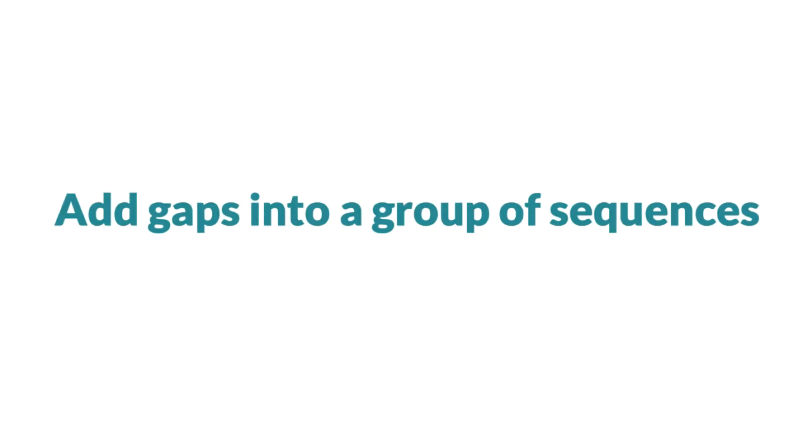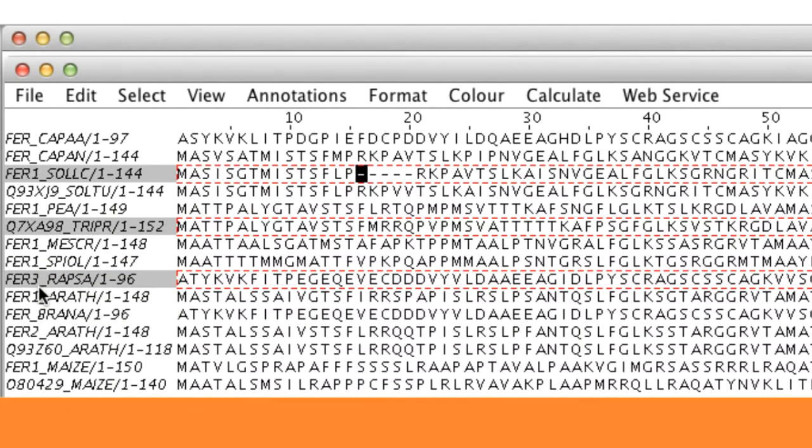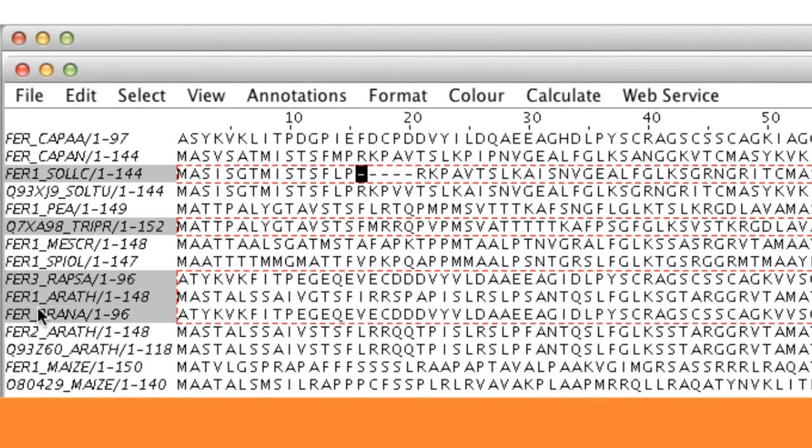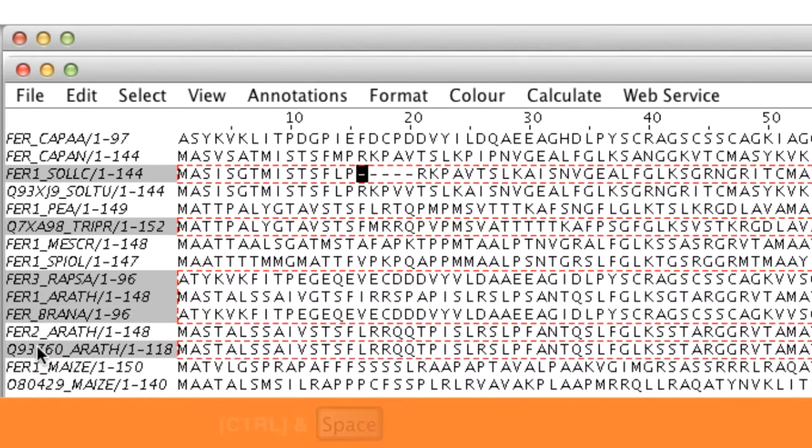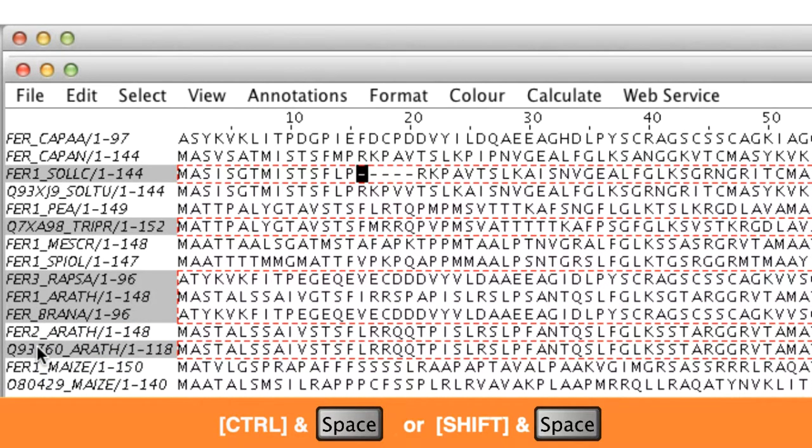To insert gaps into a group of sequences, I select a group from the Sequence ID panel as before and then hold down CTRL space or shift space.